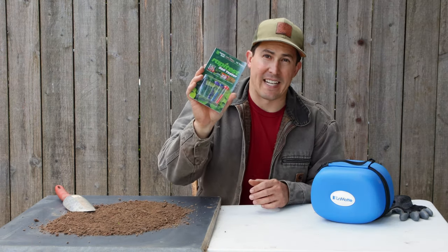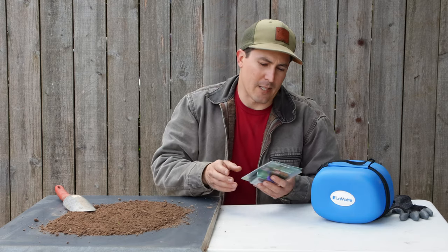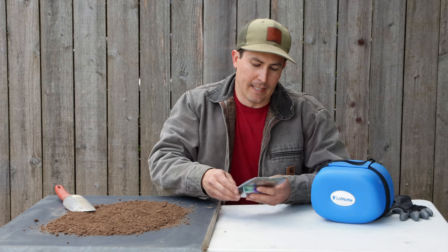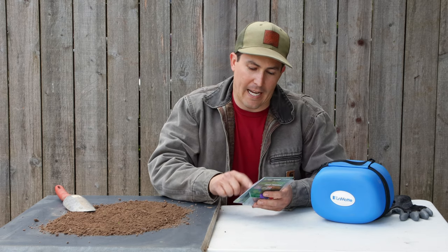I'm going to start with this Rapid Test Kit — this was by far the easiest to find and most affordable kit. This was only a few bucks at my local nursery, and it says it's going to test my pH, my nitrogen, my phosphorus, and my potassium.